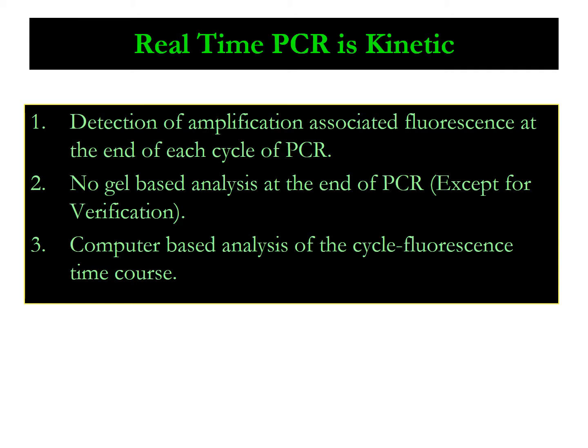The real-time PCR is kinetic. It detects amplification associated with fluorescence at the end of each cycle of PCR. No gel-based analysis is required at the end of PCR, and computer-based analysis of the cycle fluorescence gives an accurate detection of the copy number of the DNA molecules.